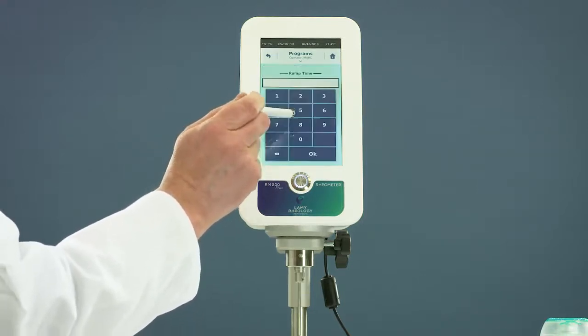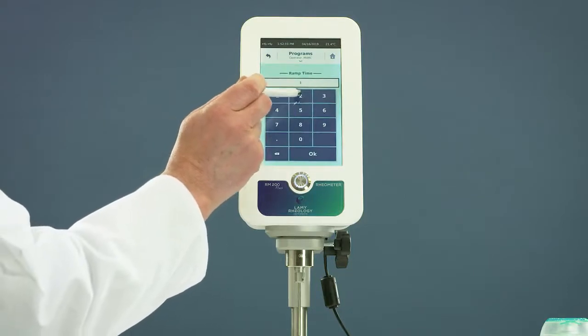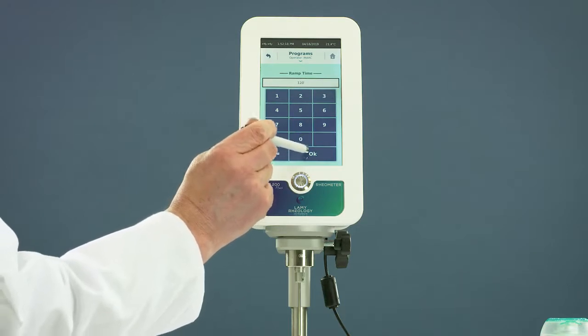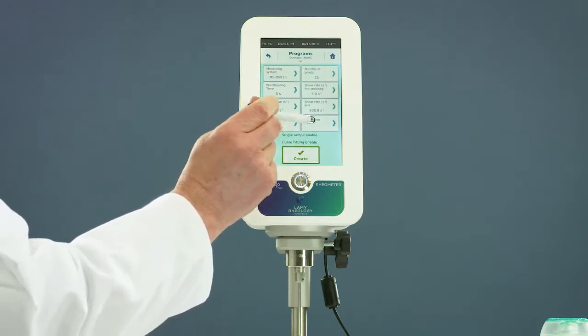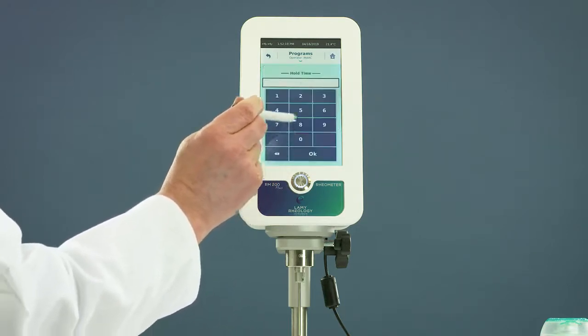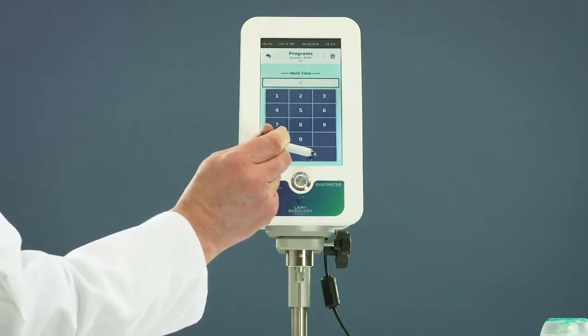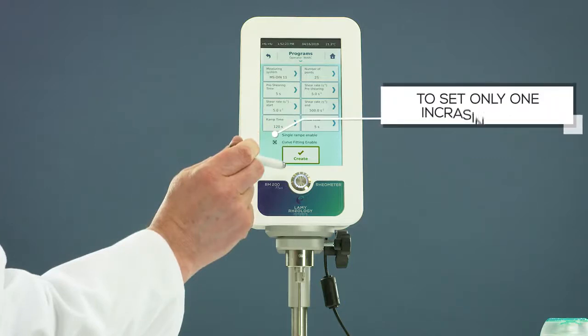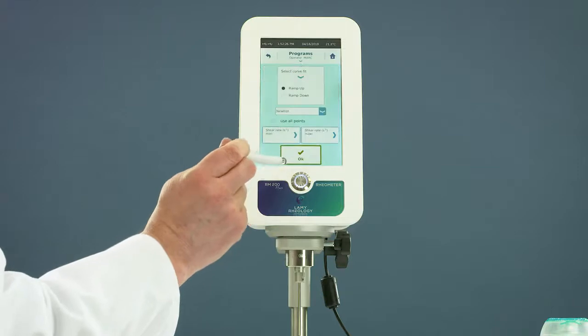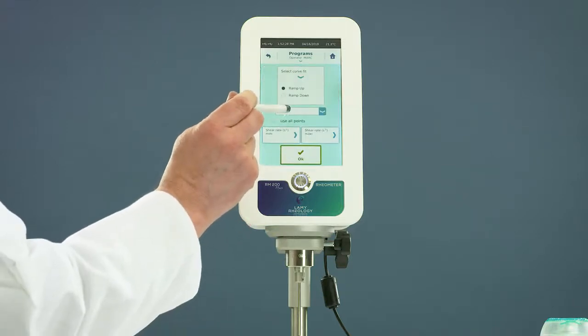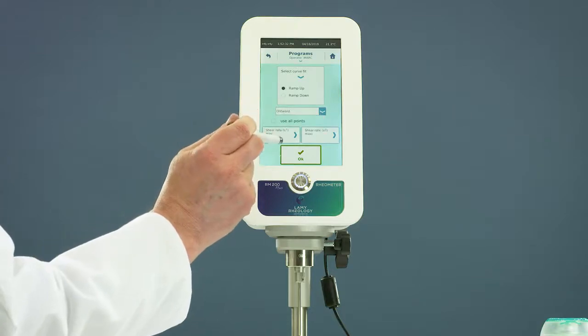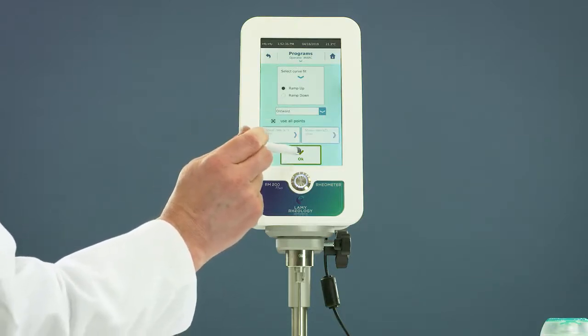Set the duration for the increasing ramp. You can hold the last shear rate value by setting the hold time. Select the fitting curve to set an analysis of the result. Choose a part of the curve and a regression model. You can analyze all data points or define limits.